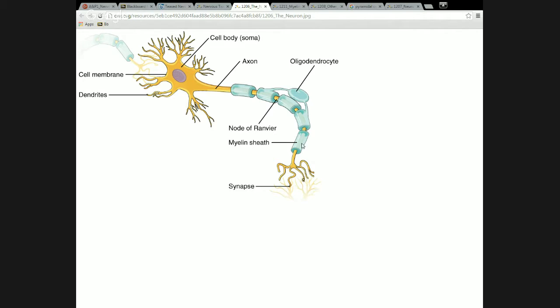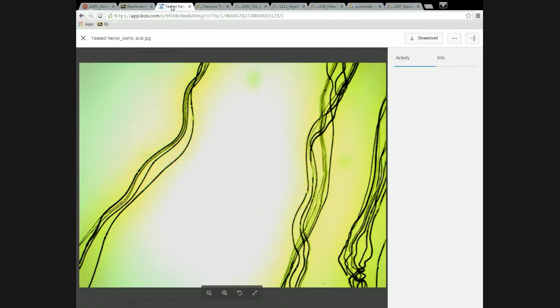Now, in a picture like this in the textbook, they're always going to make the myelin sheaths, which is what these things are called, look kind of short. But actually, and the reason why I'm showing you this picture is that they're pretty long relative to the thickness of the axon. So here's one right here. That's a gap. They're called a node of Ranvier.